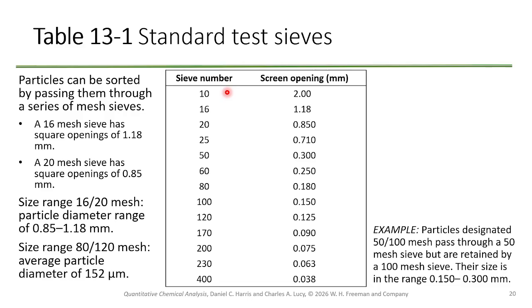Okay. You can make sieves of a variety of different hole sizes. The hole sizes are being the mesh. Okay. Mesh typically is the width of the wire. In this case, it's actually the width of the hole size. Okay. So this is going to be your sieve number. This is actually the screen opening size right here. Okay, and it's just going to be like a little metal screen like you'd see on a window. Okay, just smaller so you can have smaller things fall through.